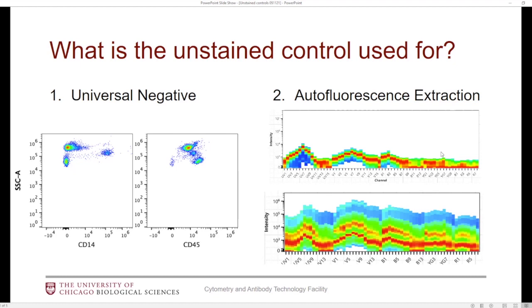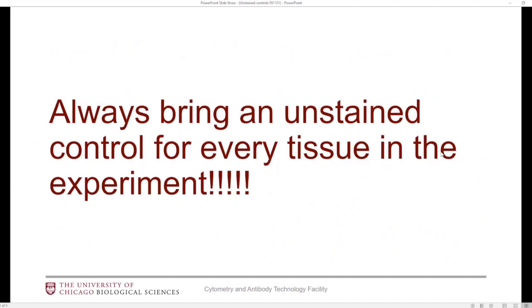If we want to use these two features, you have to bring an unstained control for every tissue in your experiment. Sometimes people forget to bring one for every tissue and just bring one unstained control. If you're using multiple tissues, every single tissue that you bring in your experiment needs to have a matching unstained control. Also, when you run these unstained controls, we need to make sure that you have enough events recorded. If you're just recording 10,000 events, it's probably not going to be enough to utilize these features properly. You're going to likely need more events recorded — I can't give you an exact number; it really depends on the tissue.